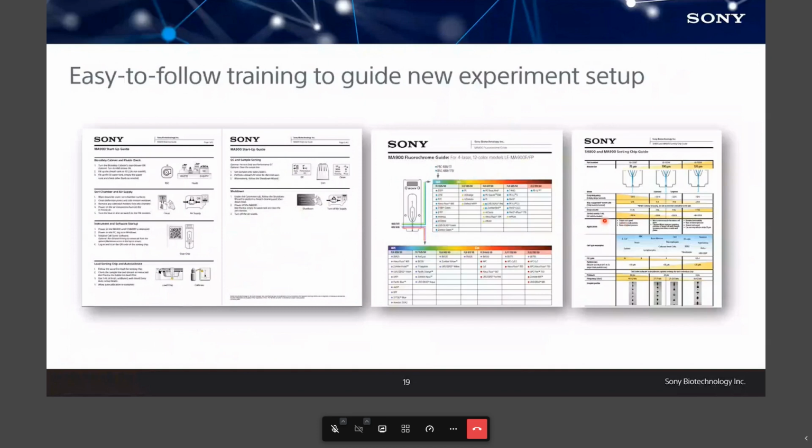We have all these little quick reference guides and training outlines that we will provide for you, and that will help you set up your experiment properly. So we know the instrument is maintaining itself, but now we know that we're setting it up properly and we're giving ourselves the best chances for success.